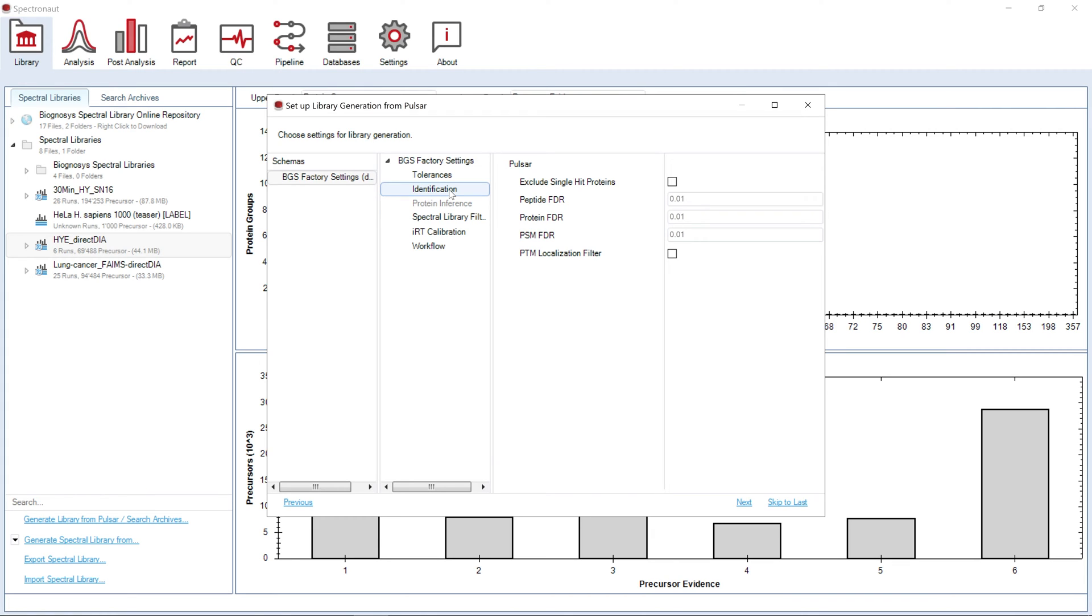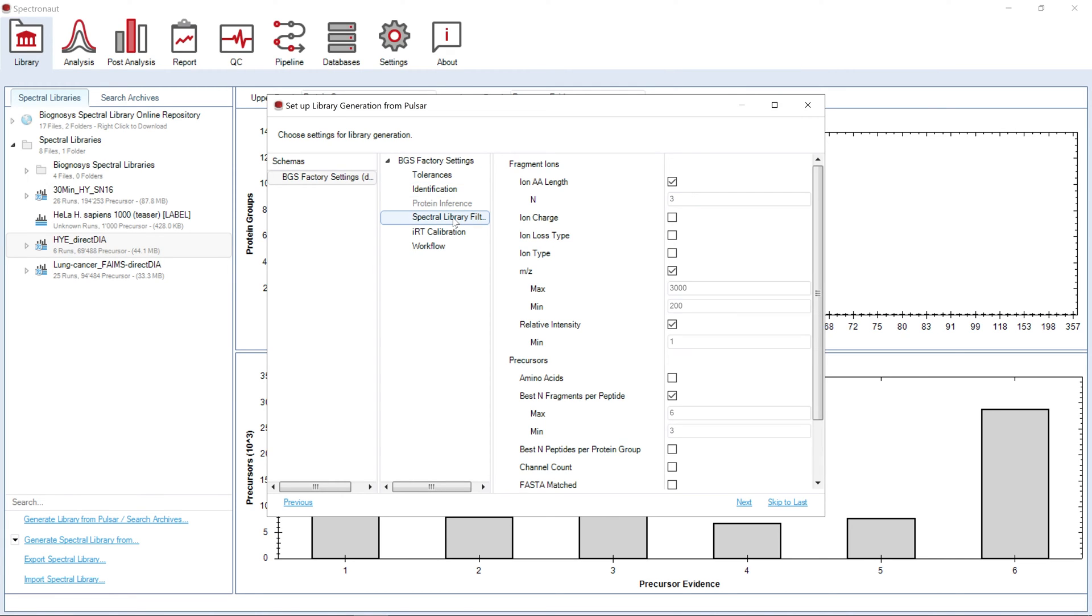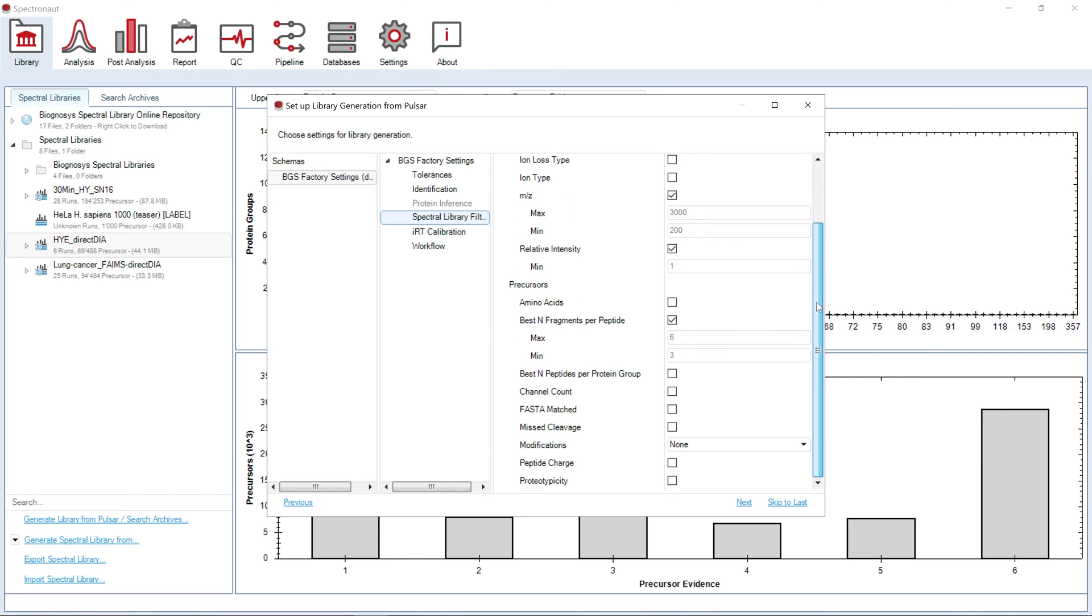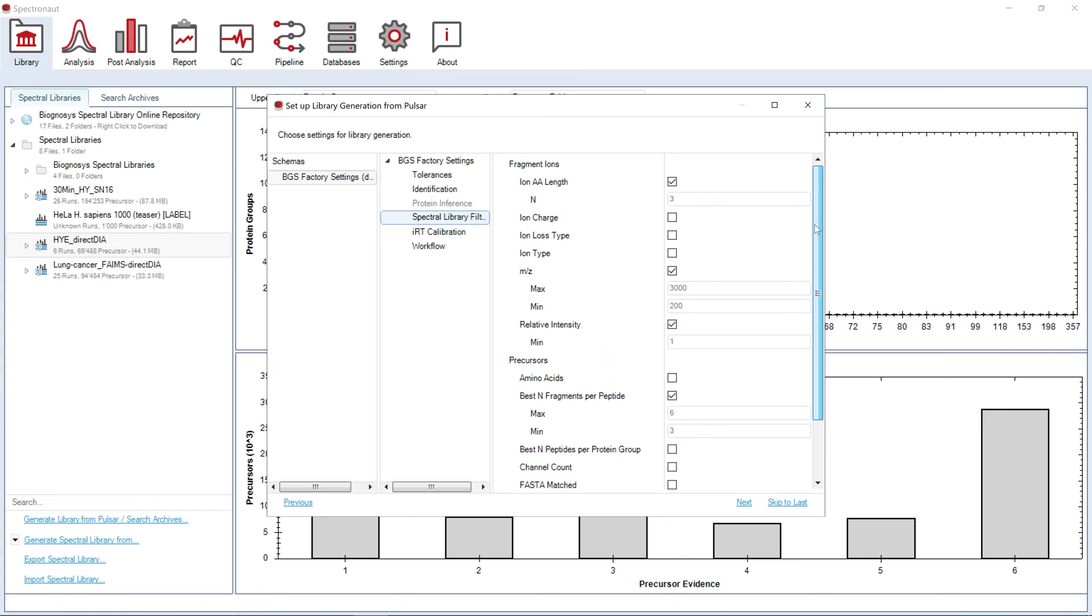Protein inference will be automatically done by the ID Picker algorithm. Spectral library filters will determine which of the identified precursors and fragments will actually be used to generate a library. Note that the majority of the filters are not selected, as adding multiple filters may result in excluding a big portion of the identified precursors and fragments from your future DIA experiment.